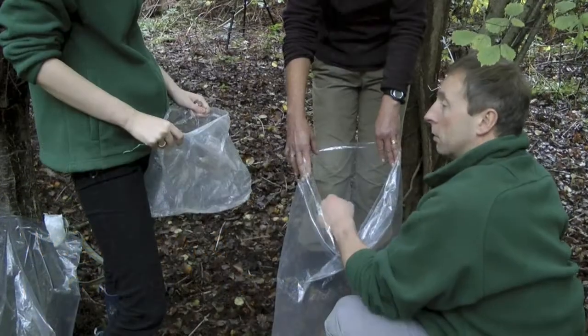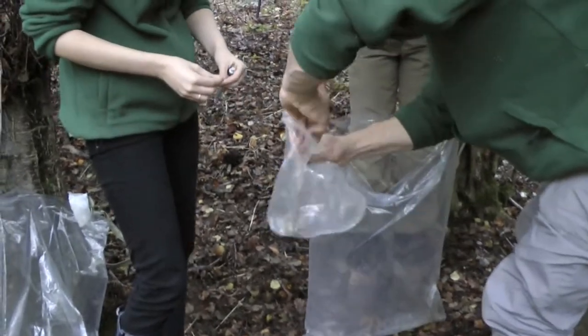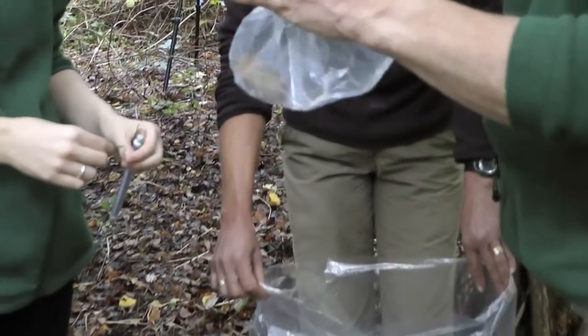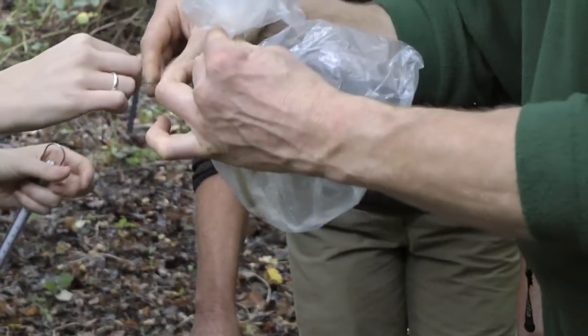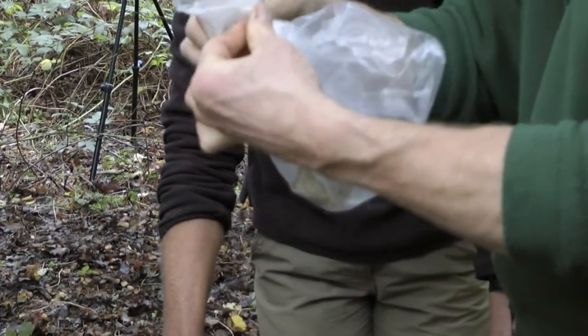The dormouse, having been caught and sexed in the large bag, is transferred to a smaller weigh bag. They may need to be gently coaxed into the bag to release the grip of their sticky feet from your fingers. It's a good idea to seal the bag with a wire tag to ensure the dormouse cannot escape.